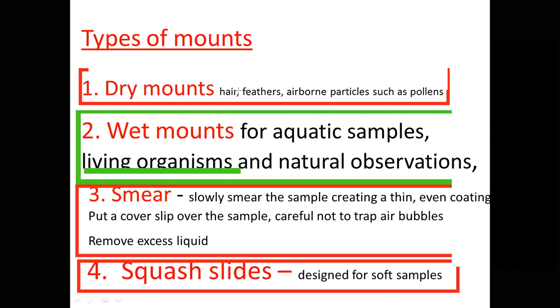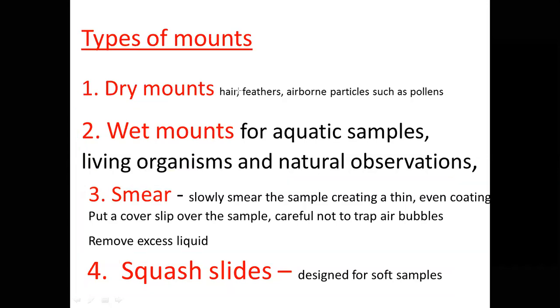And we don't want to destroy those pollen grains. We want to see them as they appear in situ. We will see how the 1995 squash slide was made.